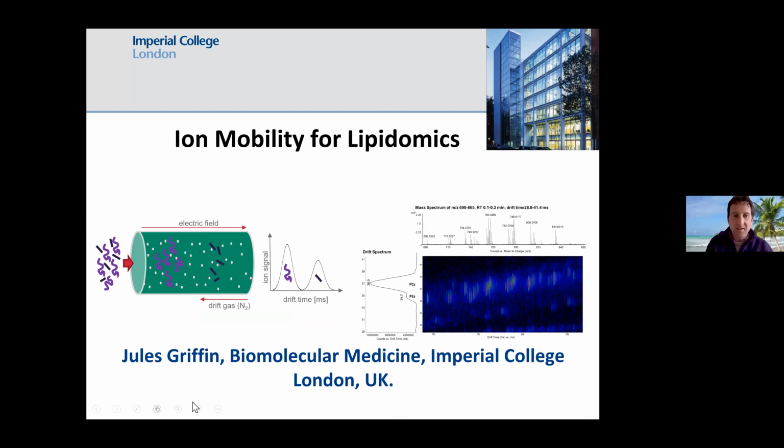Brilliant. Okay, so I'm going to talk about ion mobility now, and I'm going to start off with a few caveats. You're going to see that there are a number of different flavors of ion mobility, and I've only been largely practicing one flavor during my time, and it's been a relatively recent incursion into the ion mobility field.